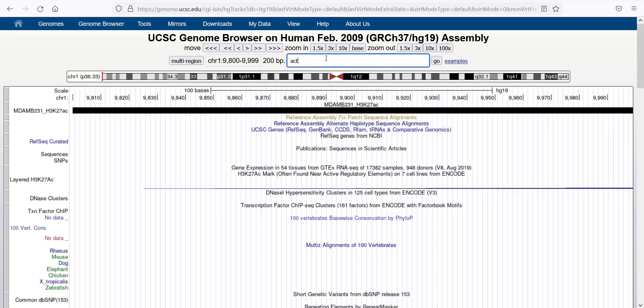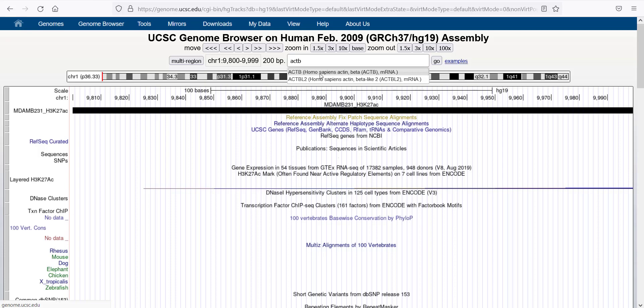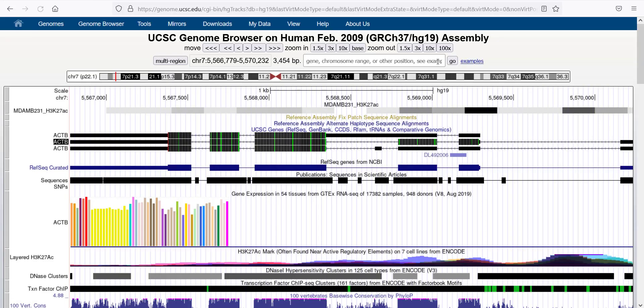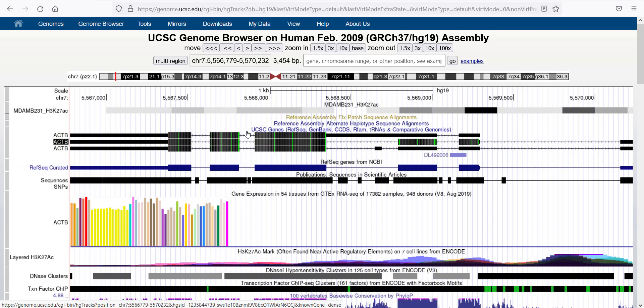I'm just going to type in a gene, beta-actin for example, and then it'll take me to this specific gene.